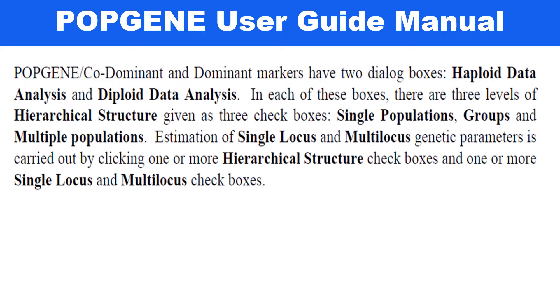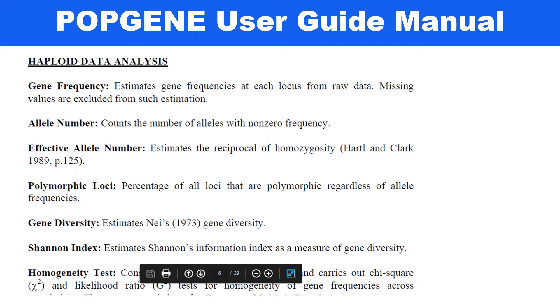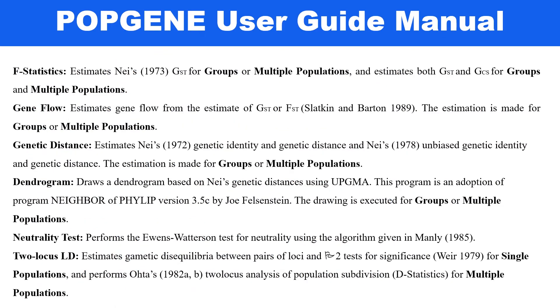The Popgene wizard guide for co-dominant and dominant markers has two dialog boxes: haploid data analysis and diploid data analysis. Each box has three levels of hierarchical structure as three checkboxes — single population, groups, and multiple populations. Estimation of single-locus and multi-locus genetic parameters is carried out by clicking the appropriate hierarchical structure. Data analysis will find parameters like gene frequency, allele number, effective allele number, polymorphic loci, gene diversity, Shannon index, homogeneity test, F statistics, gene flow, genetic distance, dendrogram, neutrality test, and two-locus LD.